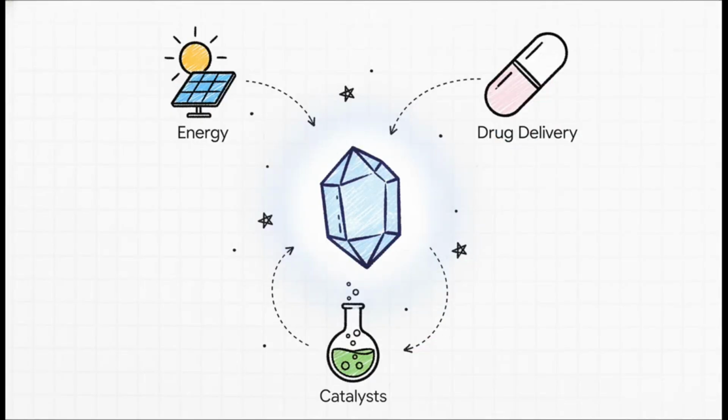So, zooming all the way out, why does this actually matter? Well, determining crystal structure, phase purity, and defects in strain is exactly how we control the quality of the nanomaterials we're synthesizing. This structural data literally dictates the macroscopic optical, electrical, and magnetic properties of a nanoparticle. It's a real game changer. Mastering XRD is absolutely essential for driving forward both academic research and advanced tech applications.